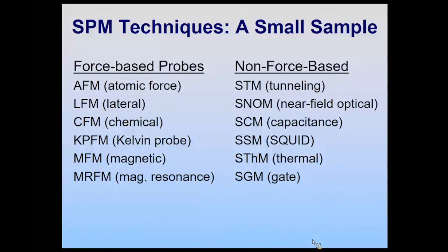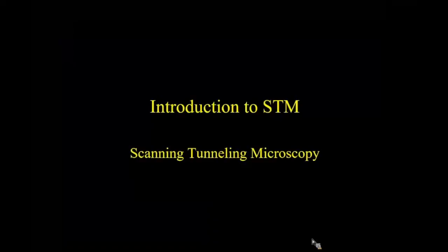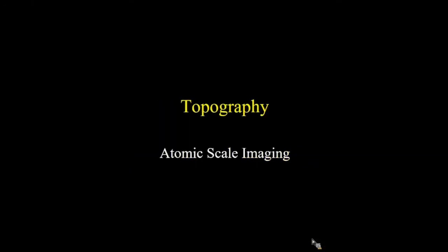And if you have interest in any of these, although sort of the headline of what's available in the 2DCC is atomic force and STM, certainly once you have atomic force, you can pretty much easily do any of these. Well, this last one's a little challenging. I'll talk about that a little later, but the other one's a pretty straightforward extension to a standard AFM. If you want to do scanning SQUID or NSOM, that would take a little bit of upgrade to the instruments.